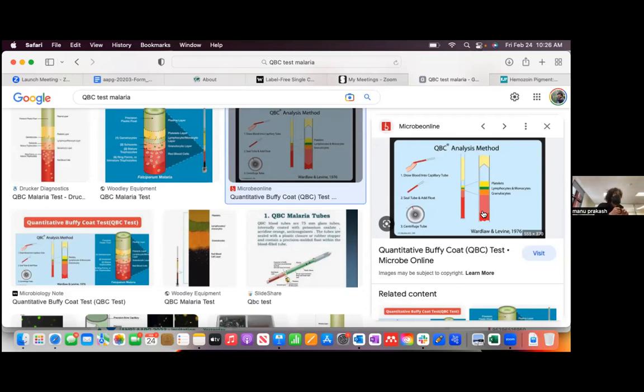Just a quick question about how this works. Is it flush against the tube? No, there is a gap. If it's totally flush against the tube, then you will have no liquid in the middle, and it doesn't work. So it's just smaller than the tube, so it can freely move up and down, but it will settle exactly where the densities are matched.